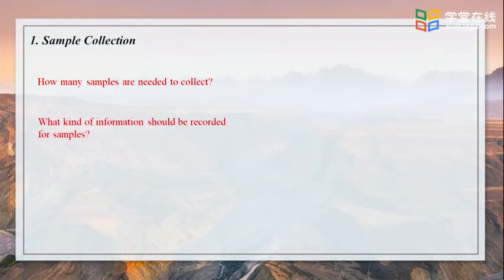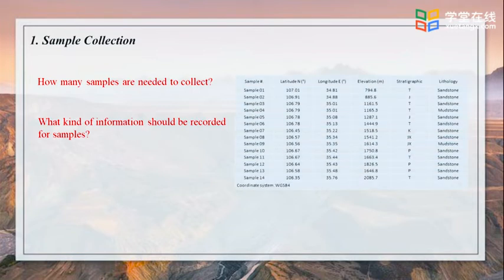Soil and weathered surface should be removed as much as possible. What kind of information should be recorded for samples? It is critical when sampling to accurately record the sample location, usually with a GPS, such as horizontal datums in latitude and longitude, and vertical datums as elevation or depths. This is particularly important for future users of the data and for databases and modeling.